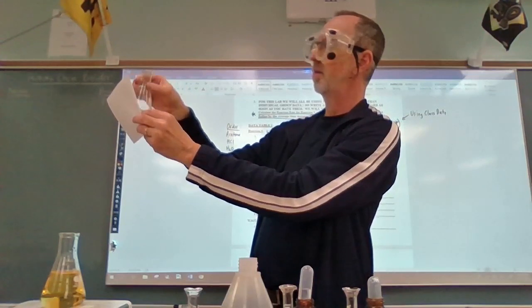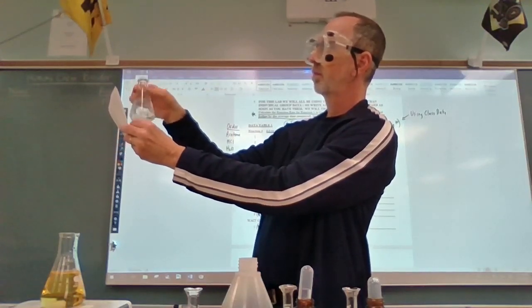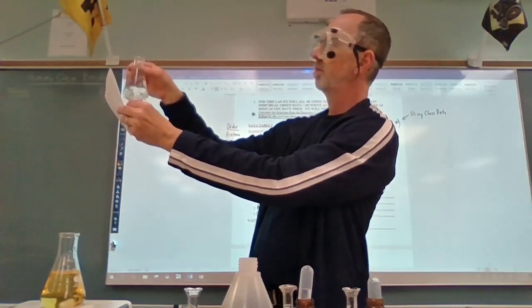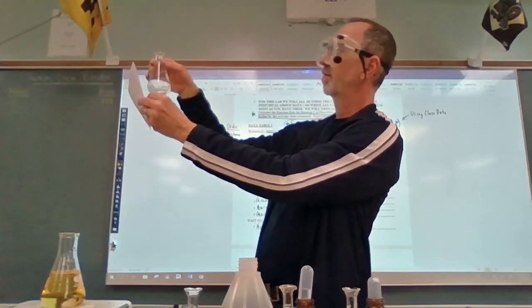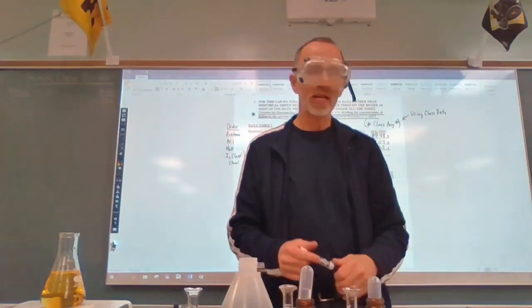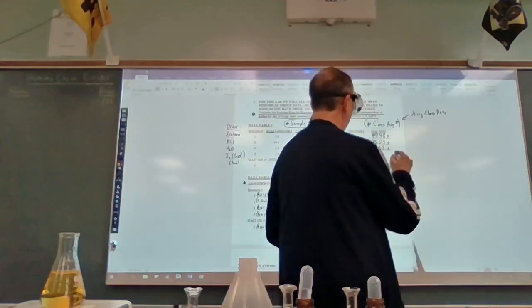Finally, starting to lighten up now. Getting close. Getting really close now. In fact, I think we're there. Yep, we are. All right, so on that one, I actually got 58.11 seconds. The class average from last year was, let me see, 53.13.